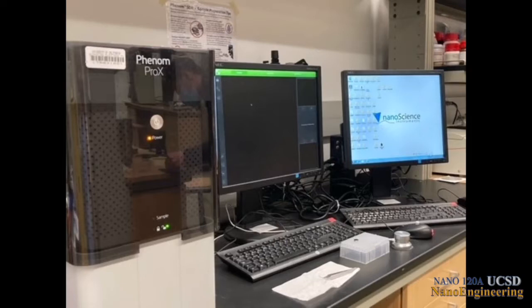There are two types of detectors on this instrument: a backscatter electron detector and an X-ray detector. There is no secondary electron detector. The backscatter detector is a segmented detector used for imaging and can be operated to provide atomic number contrast and topographic contrast.